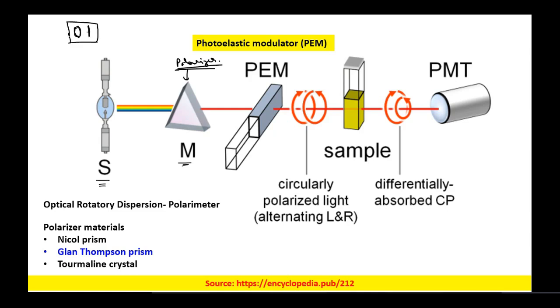So within that excitation optics, you also have the polarizer. After this, you get linearly polarized light. You have to keep this in mind.